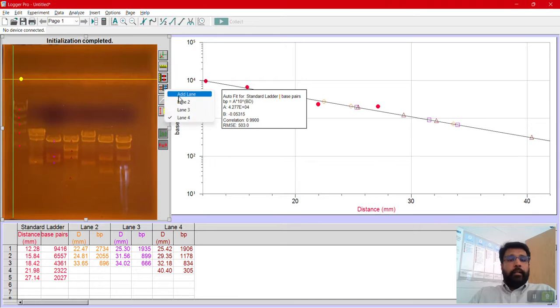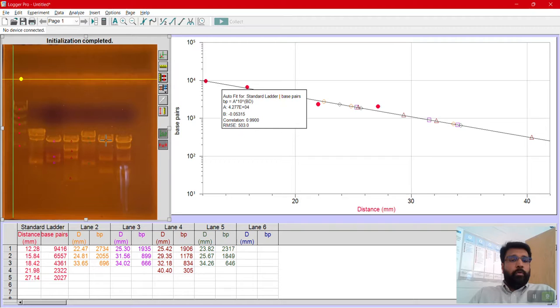Then add another lane, which is this one, that is suspect number 3, right here, this one, and this one. Then you go back and add another lane, which is for the suspect number 4, right here, another one, and another one. Then the last and final one, which is suspect number 5, right here, right here, right here. And then we have another, there's a glare. They took the camera, but still we can see that one there as well.